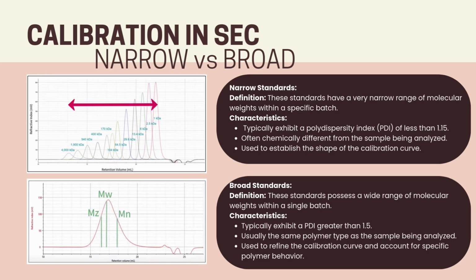Both narrow and broad standards have their roles in SEC calibration. Narrow standards provide a foundation for the calibration curve, while broad standards enhance its accuracy and applicability to specific polymer systems. The choice of the standard depends on the nature of the sample and the desired level of accuracy in molecular weight determination.